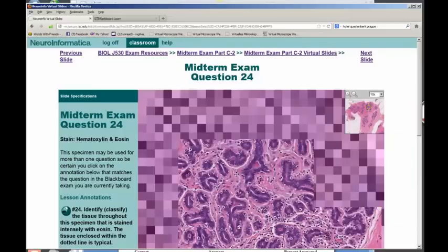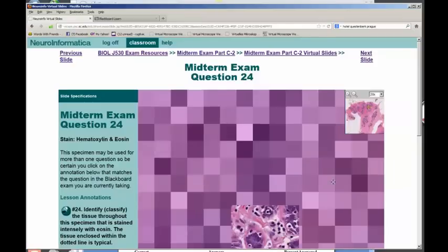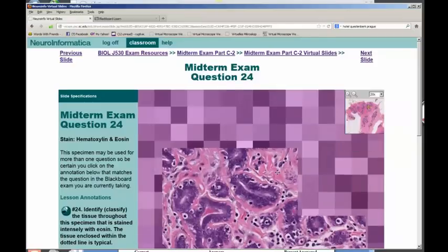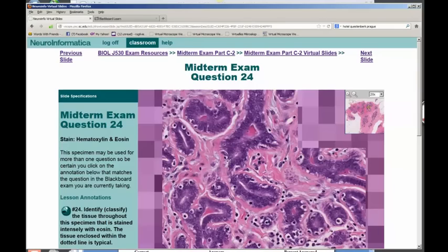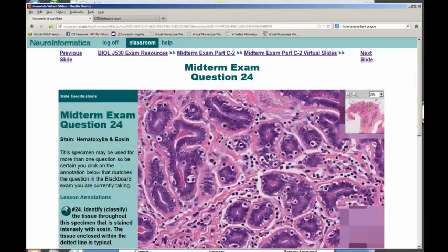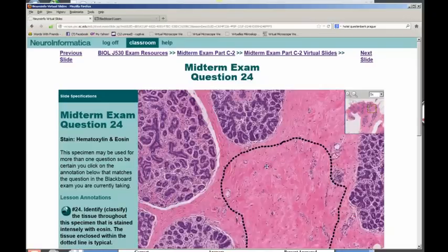These are all the epithelial cells of the mammary gland, and these form the ducts. Between those, you'll also have connective tissue that's a little bit looser here, with a dominance of cell types. So this would be loose connective tissue here, between the epithelium, and this is dense irregular. Okay, so we're going to the last question now.